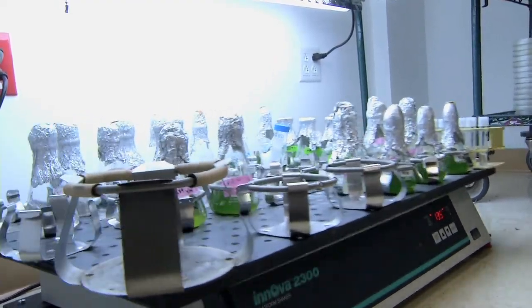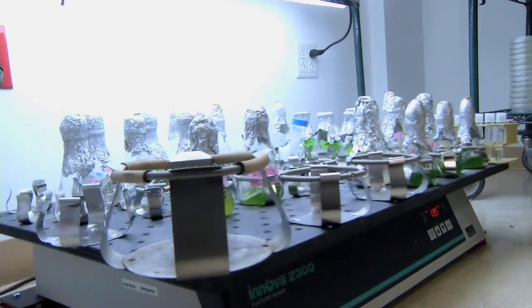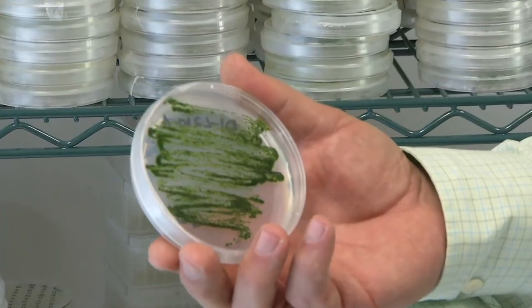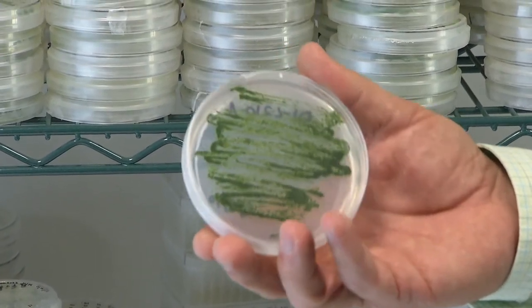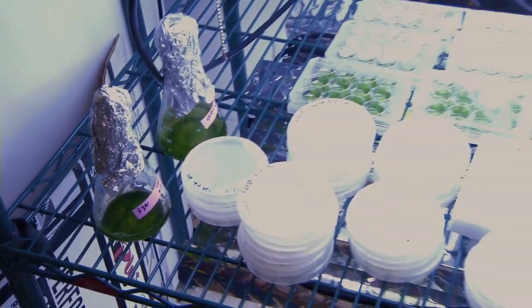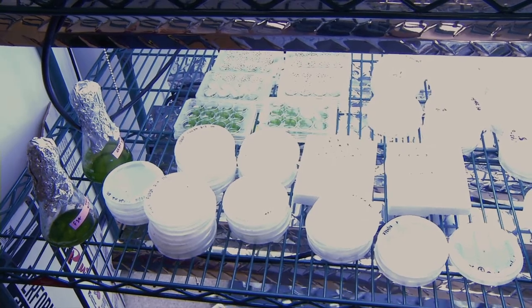In this room, we have algae growing under a variety of different conditions. We have algae behind me on petri dishes. These algae are largely all genetically engineered, and each dish will have a different type of genetic modification. Over the years, we've made many different types of genetic modifications in the algae.